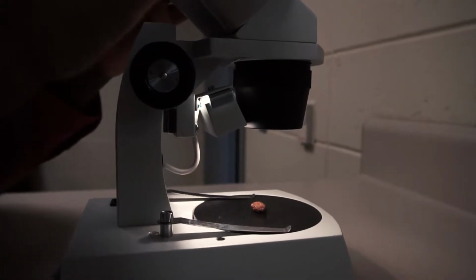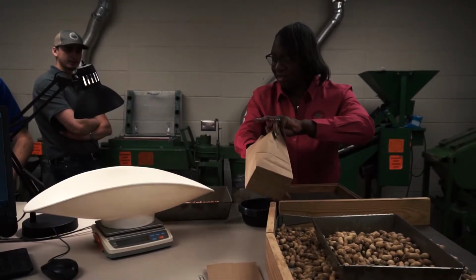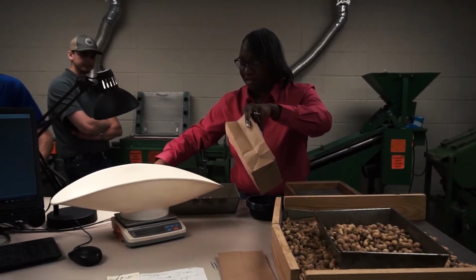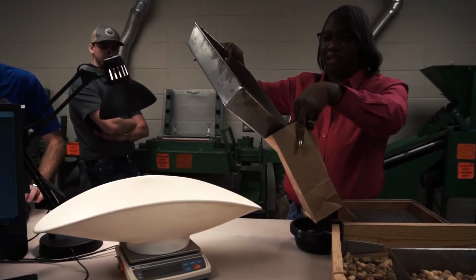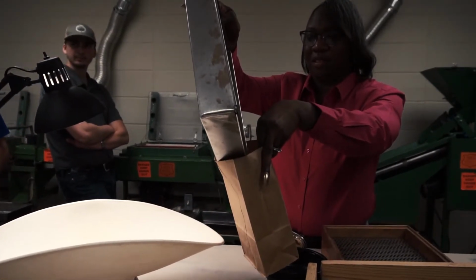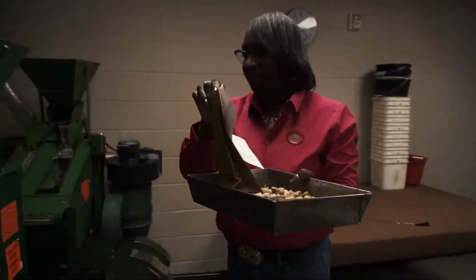This one was free of mold and returned to the sample. What would happen if there was visible mold? If the kernel had been positively identified with A. flavus mold, the load would be reported as Seg3. The kernel would be placed in a small bag and identified with the trailer number, date, and SC95 certificate number and held for further examination, if necessary, by the supervisor. After the visual examination, the LSKs are placed into a bag for aflatoxin chemical testing at a later step.